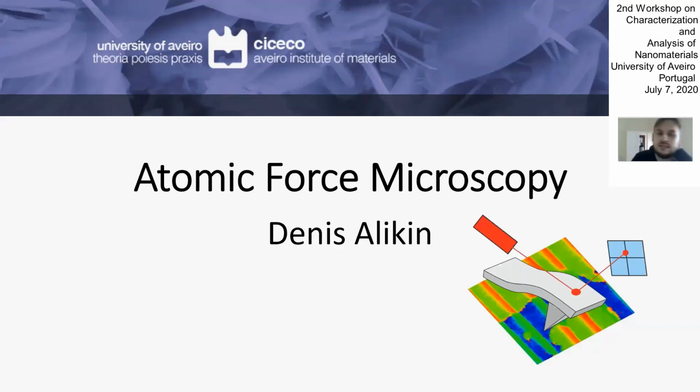Okay, thank you for the introduction, Igor. So today I'm going to talk about atomic force microscopy, and I think it will be a basic talk about the main things: how to operate AFM, what kind of modes AFM usually has, and how to implement them to get really quantitative measurements by AFM. And if you have any more questions about some specific modes, you may ask me in real life or by email, so I can also address your questions later.